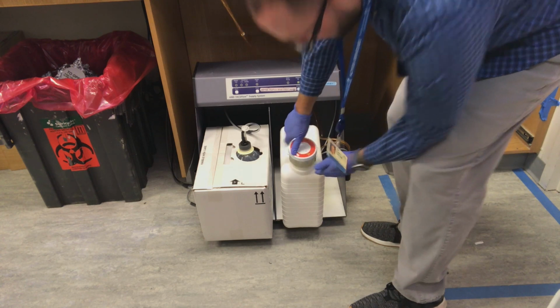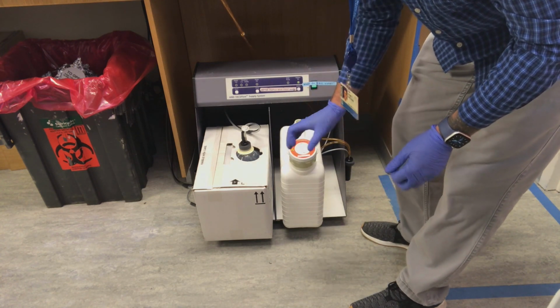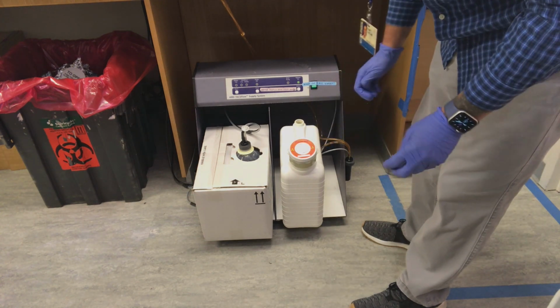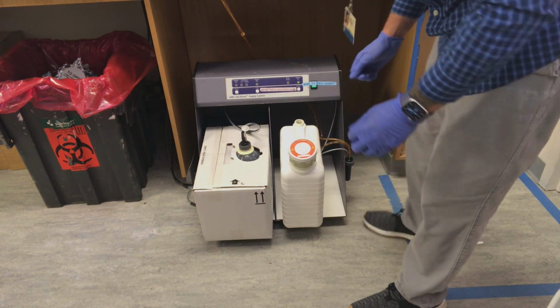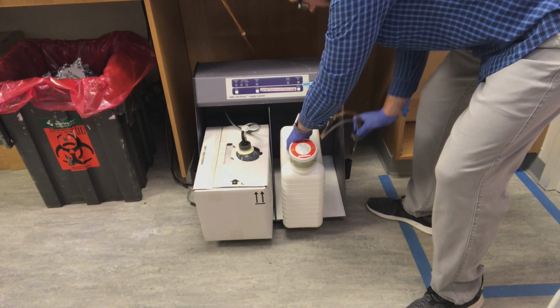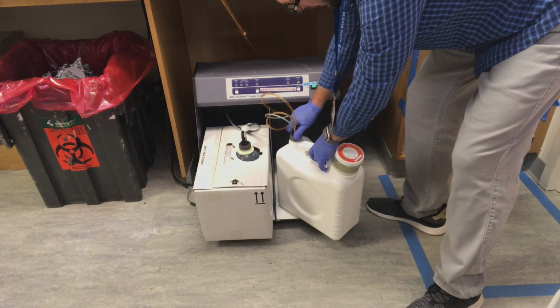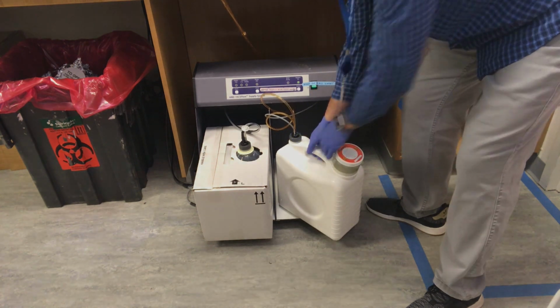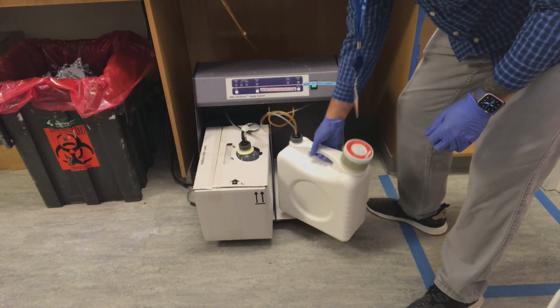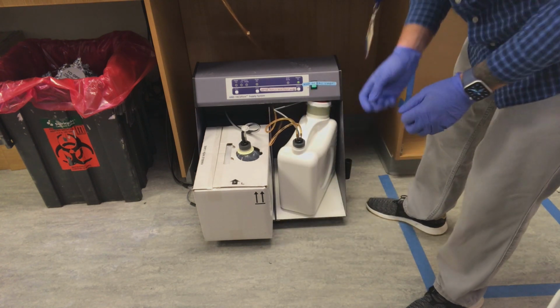We can then screw our filter back on. Just hand tighten, it does not need to be very tight at all. And then you can take your probe and hand tighten that in place as well. This can be stowed in the wet cart as such.